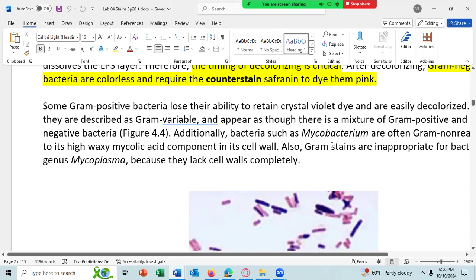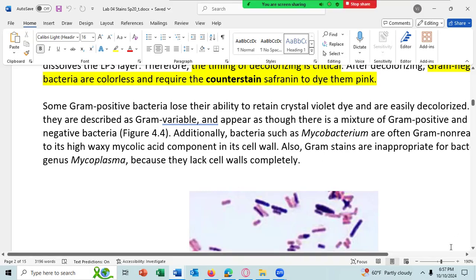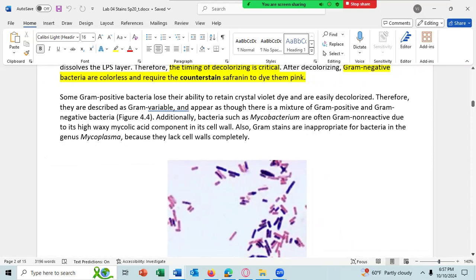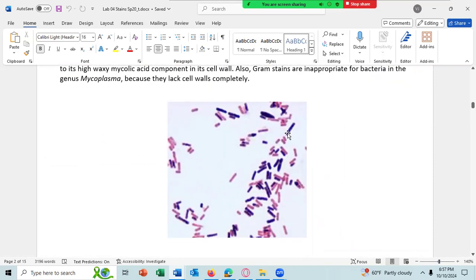The mycobacterium are gram positive, but they do not stain well. They do not readily take up the dye, so they stain lighter. But if the gram stain is done correctly, where the cells are at most 2 days old, they will stain gram positive, at least every time I've done it, which admittedly I've really only looked at two species. The Mycobacterium have, I don't know, about 10 species in them.